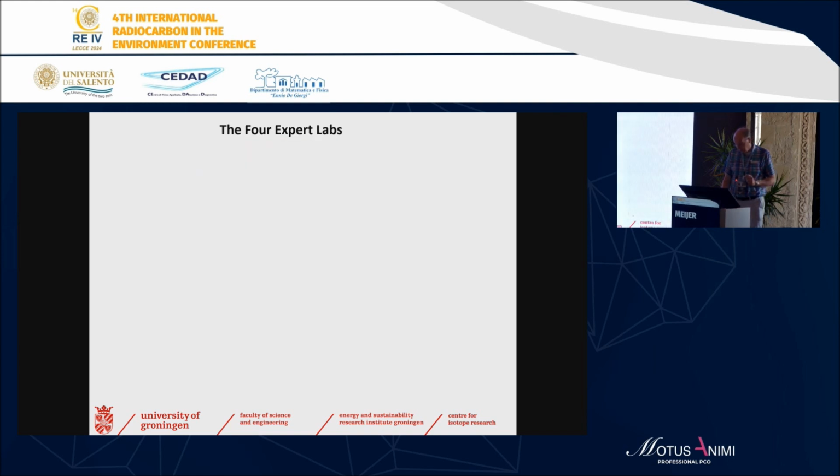Then the 4 expert labs, I think, including me, 3 of them are present here. They have generally very different preparation schemes. Some of them were already dealing with gases before. Others had to think how to do this, because usually we work with solids.